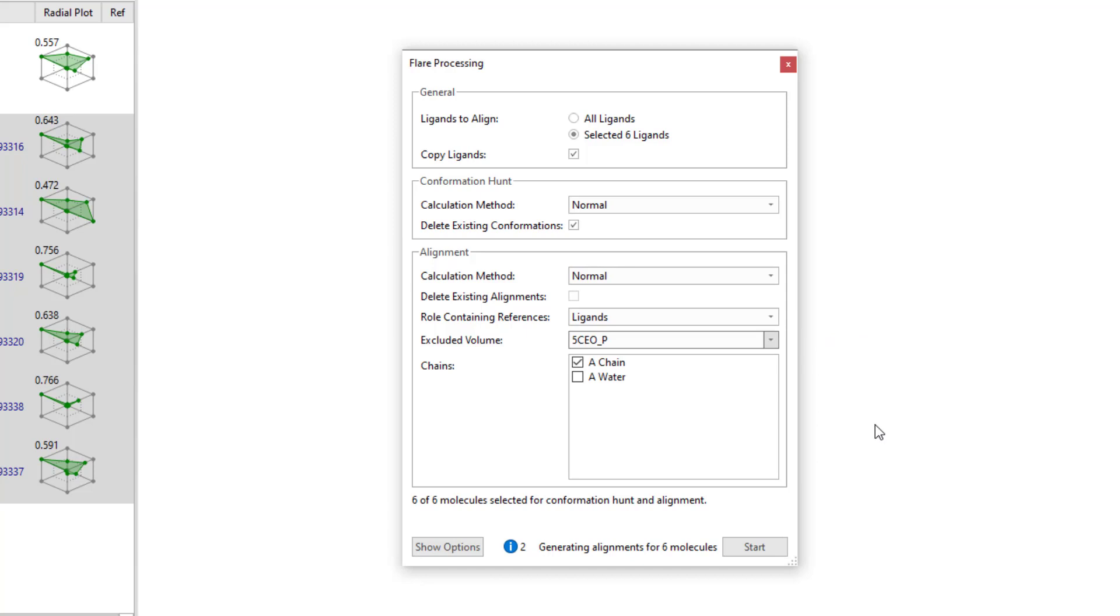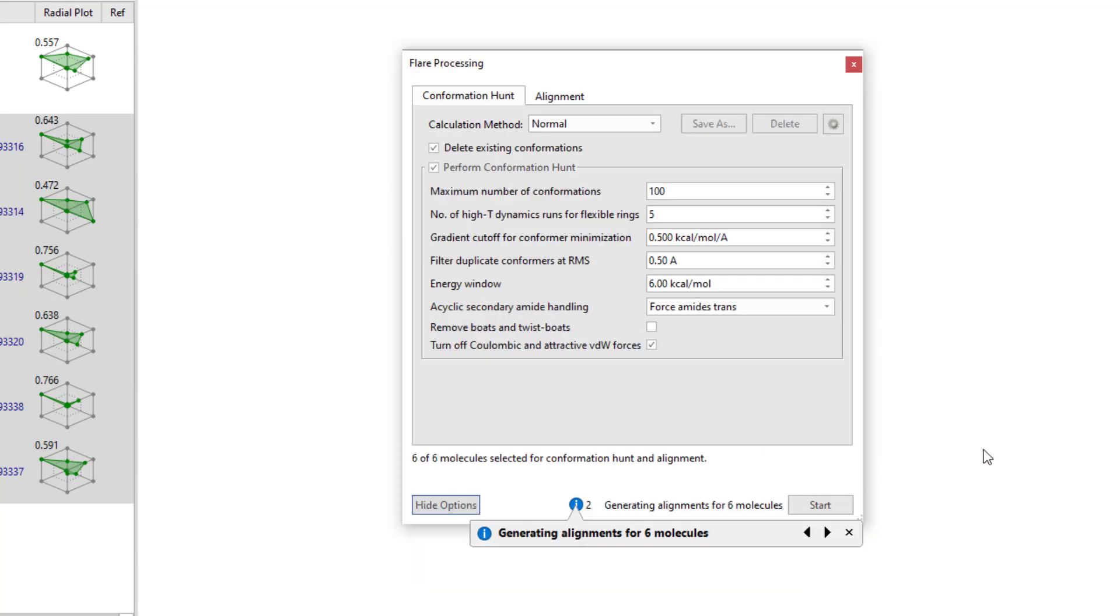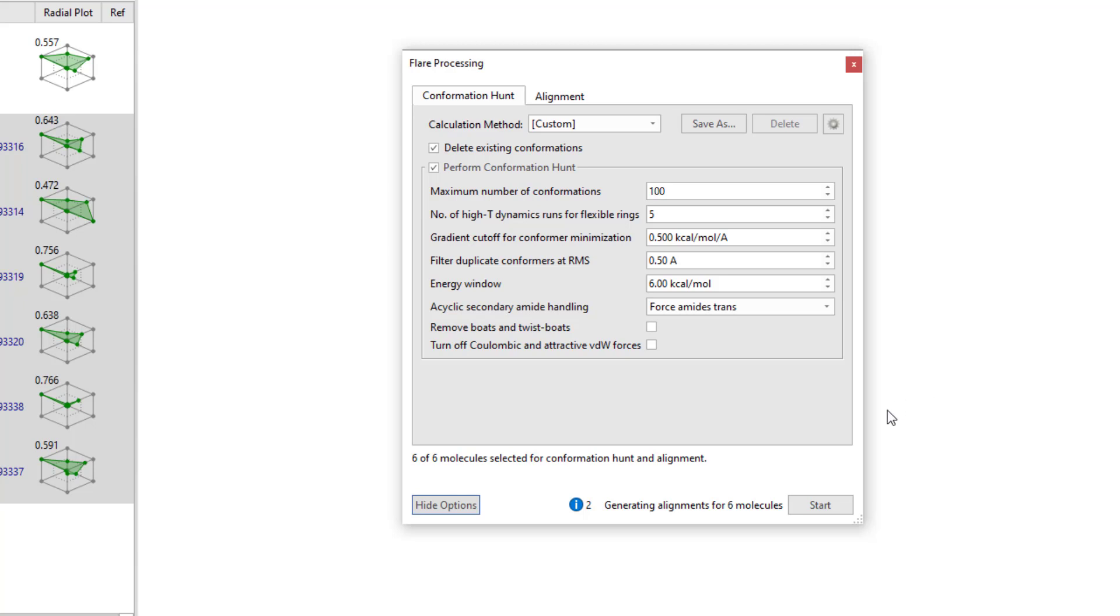I will view the advanced settings by hitting the Show Options button, where I will disable the Turn Off Coulombic and Attractive Van der Waals Forces tick box. Doing this will ensure that intramolecular interaction is retained in the generated confirmations. I will accept the other default settings and hit Start.